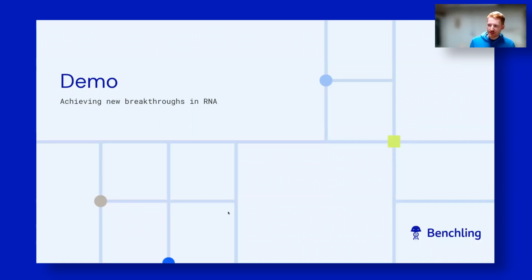We'll look at how Benchling's design tools make it easy for me as that scientist to not only view my modified sequences of mRNA, but also introduce new chemical modifications. Secondly, I'll show you how easy it is to also get the detail you need at both the biological sequence level, as well as the more detailed structures of those chemical modifications. We'll also see how we can search by chemical modification to make it easy to find what you're looking for.